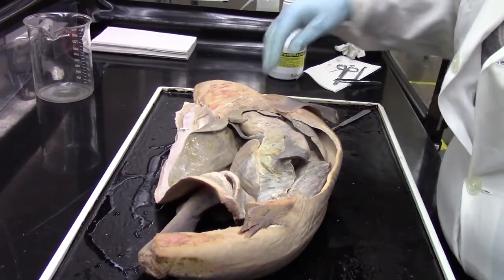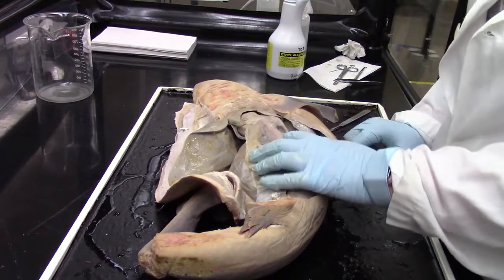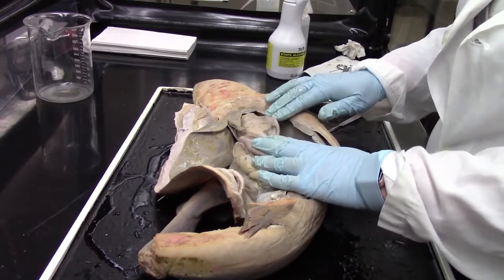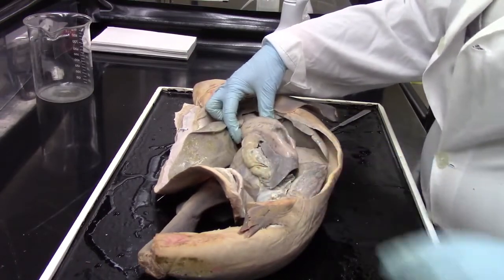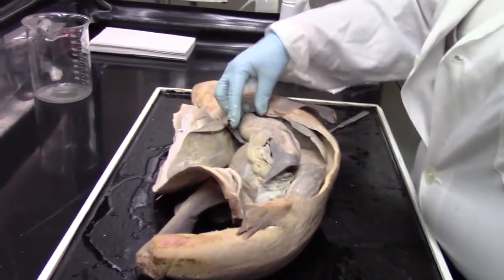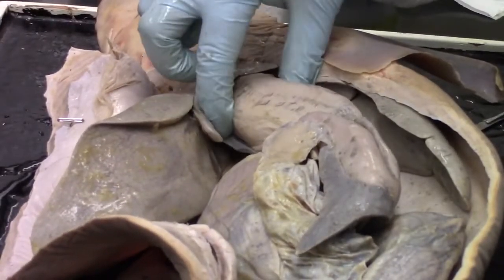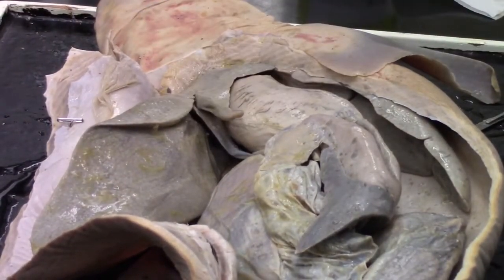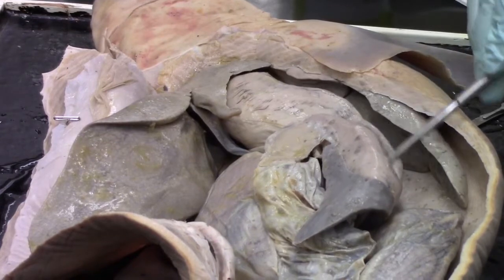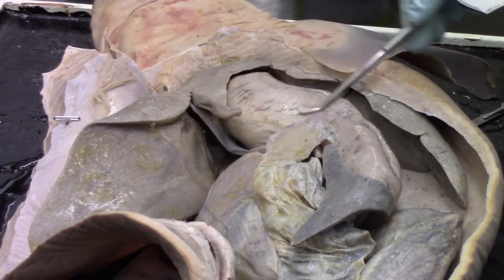Now if we look a little closer, again, her anatomy looks a little bit different. For her, she actually ate something a little bit more recently than the male did, because she has a really distended esophagus here. So this big thick portion there is the esophagus. Again, not normally that thick, but since she has eaten fairly recently, we can see that there. So that's her esophagus going into the stomach. So the stomach's actually fairly empty in this shark. Most of what we're seeing is in the esophagus.